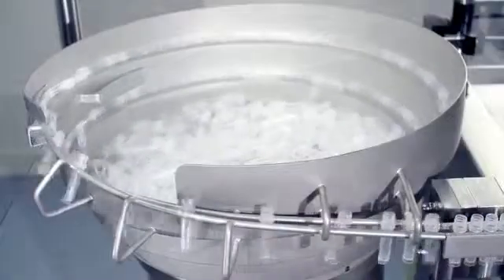One version of the FMB210 is ideal for aseptic filling and capping of microtubes in the biotech and diagnostic industries.